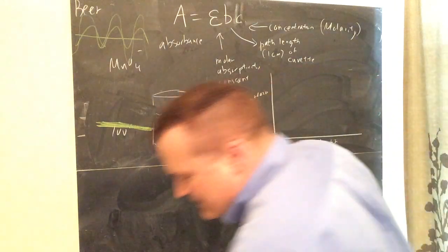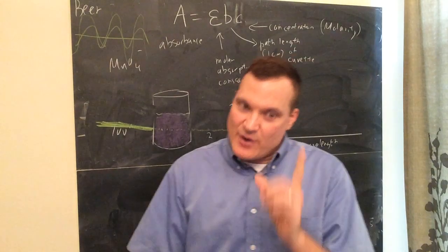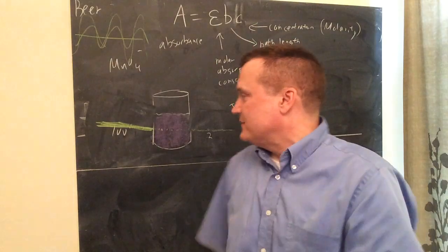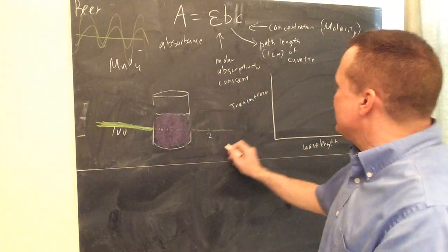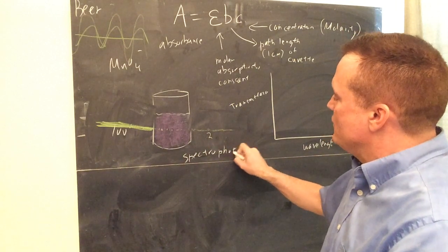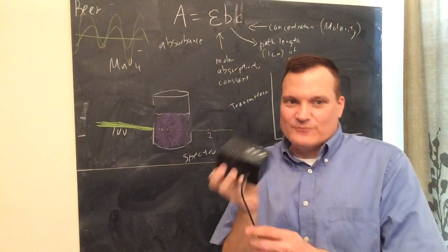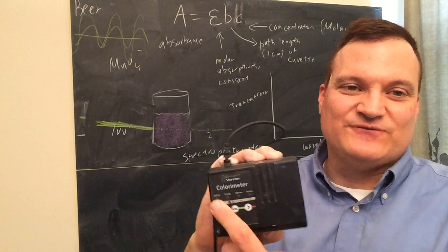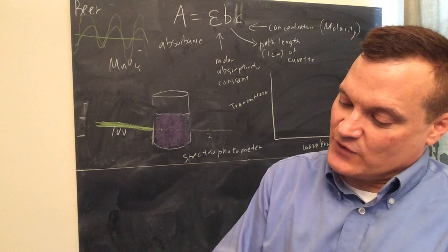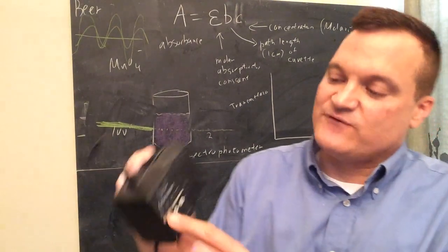All right, so before I go any further, let's say we are doing the experiment. Here is what you're supposed to do if we have the correct equipment. There is something called a spectrophotometer. Now, this one that I have is a simple one that only gives you 4 possible wavelengths from 430 all the way up to 635. Yeah, 430 to 635.